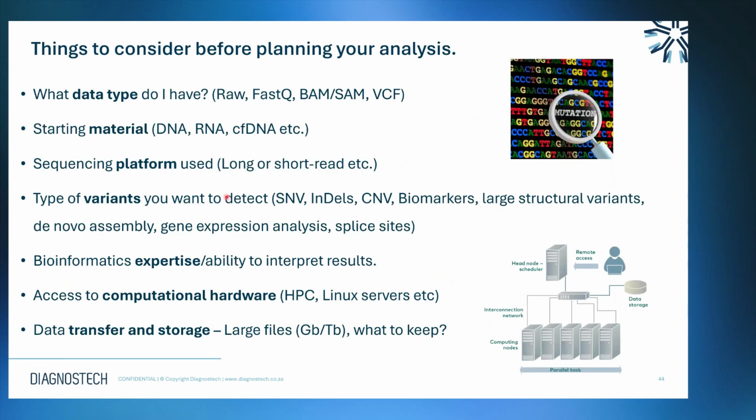So that comes to the end of the talk. I just want to cover this final slide. If you're thinking of going and analyzing data or starting a sequencing project, it's really good to start thinking about your analysis before you even go ahead with sample collection and sequencing.